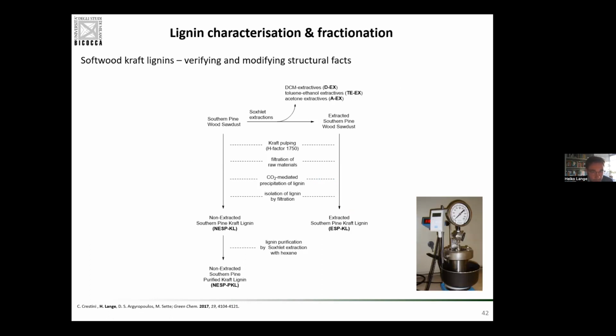Doing that, as I said, I have the great advantage that I might see in a fraction structural motifs that, in the together of everything non-fractionated, are so little in abundance that I would not see them, or that I would disregard them as something not worthwhile analyzing because it would be a minority in terms of structural ingredient, for example.